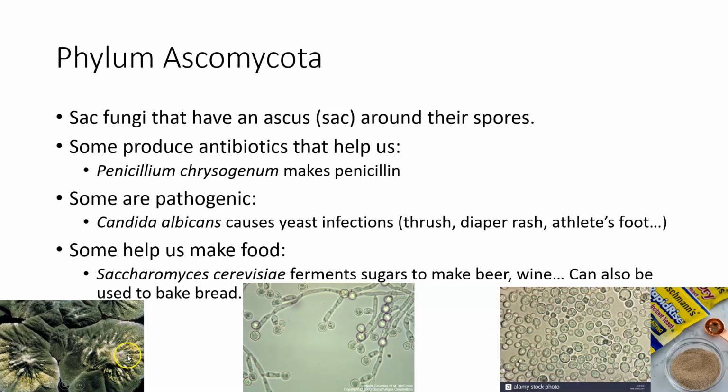They have given you a different picture of penicillium, and the picture that they gave you, I have always remembered microscopic penicillium because to me it looks sort of like skeletal hands reaching out. And so, I don't know, doodle a picture of penicillium with the little skeletal hands reaching out instead of this one. This is the macroscopic version. They gave you the picture of the microscopic version.